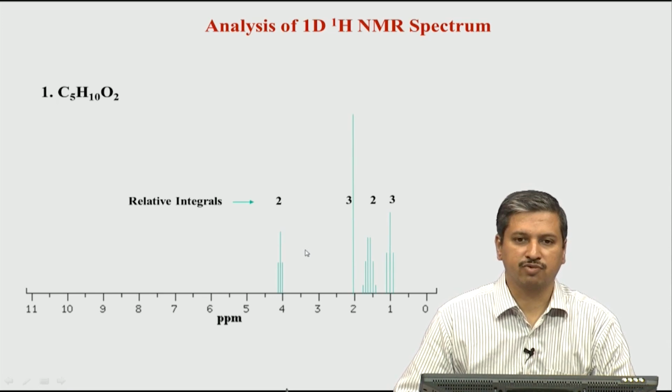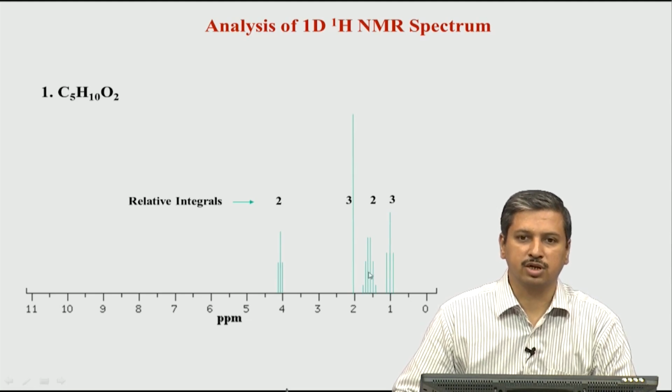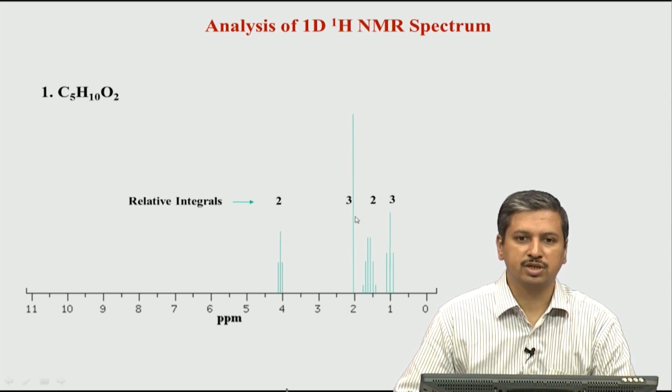The next task is to figure out what molecular structure will fit this spectrum. We are doing the reverse approach: given a spectrum, what structure matches it? Remember, the methyl peaks always come in this particular region.